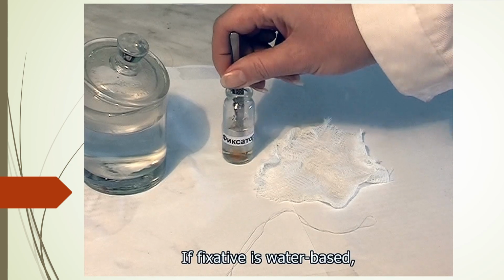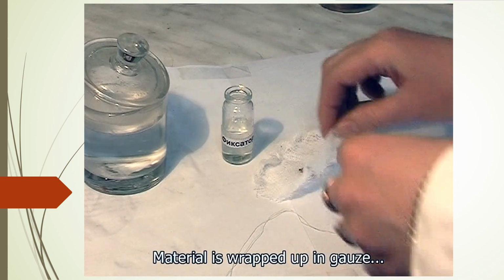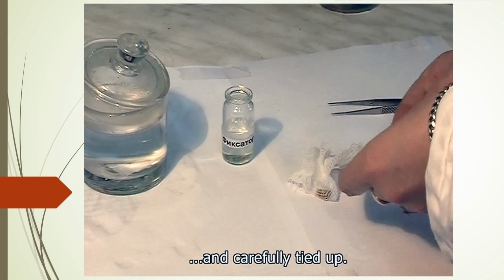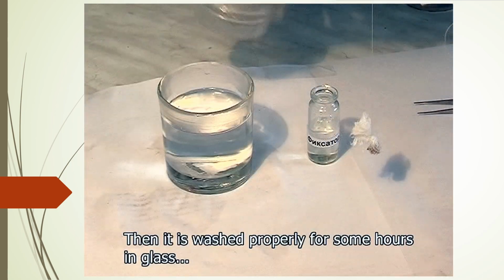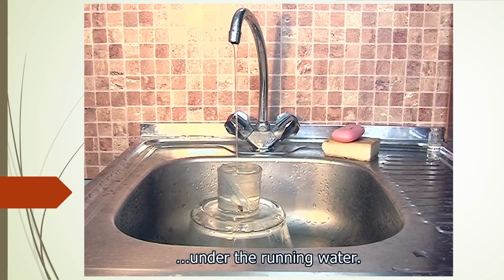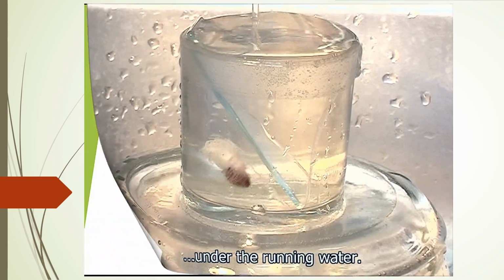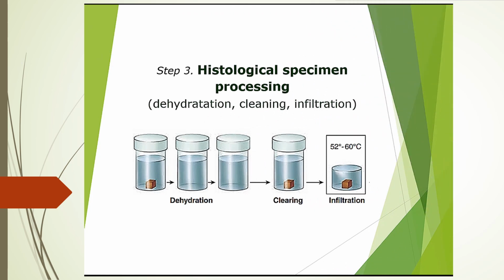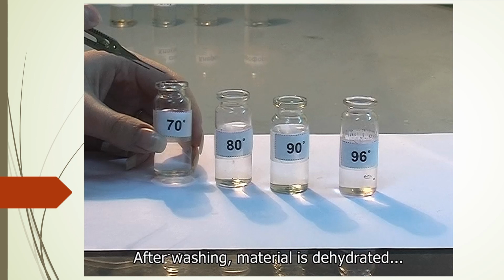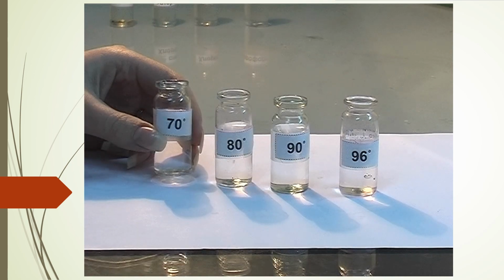If the fixative is water-based, then usually washing is done. The material is wrapped up in gauze and carefully tied up. Then it is washed properly for some hours in a glass under running water. After washing, the material is dehydrated by passing through ethanol of increasing concentration.